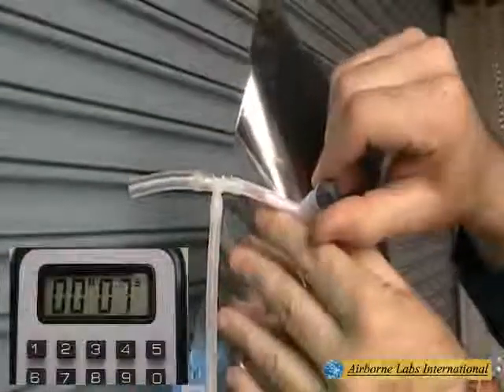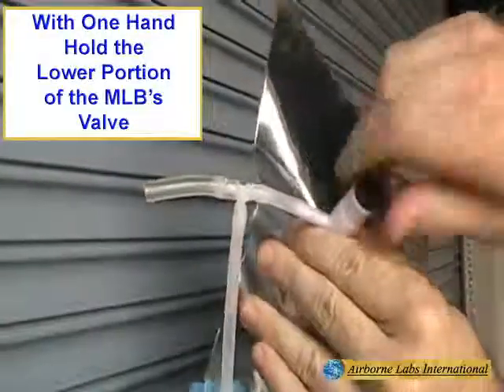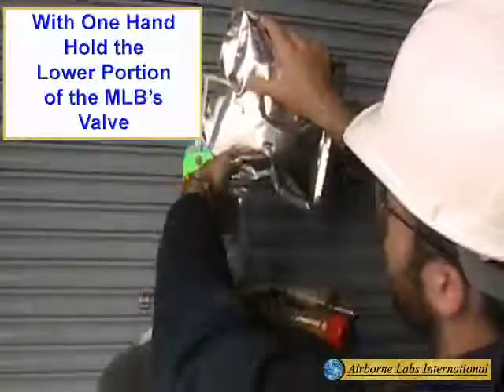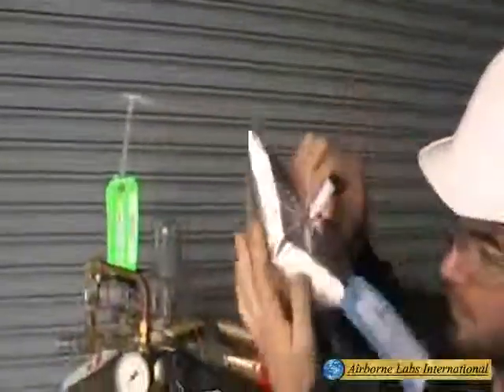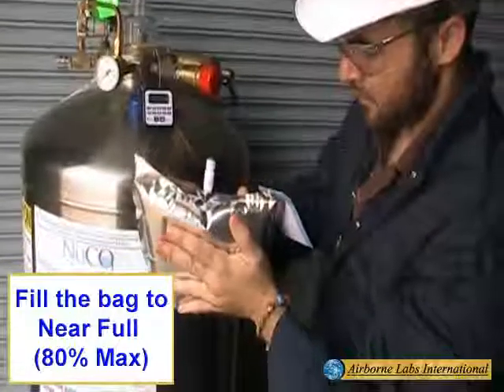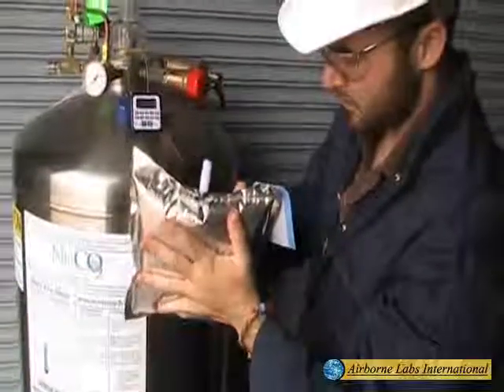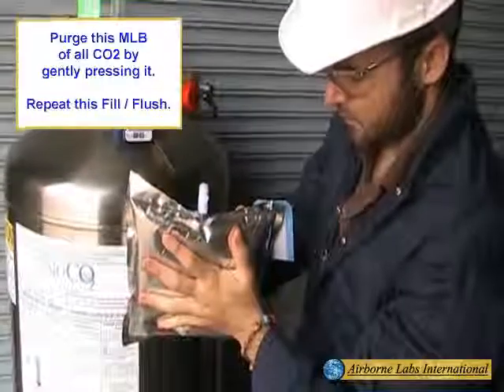Wait about 10 seconds for MLB port purging. Next, with one hand holding the lower portion of the MLB's valve, use the other hand to open the MLB's upper valve head by turning the knob about a quarter turn counterclockwise. Fill the bag to near full, approximately 80% max, then disconnect the bag from the T-Fitting. Next, purge this bag of all CO2 by gently pressing it.